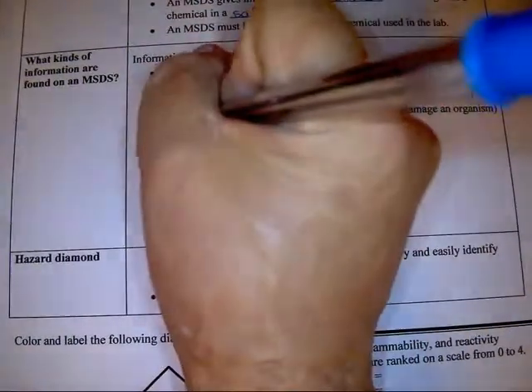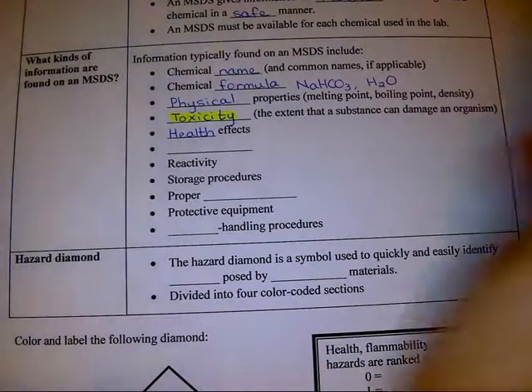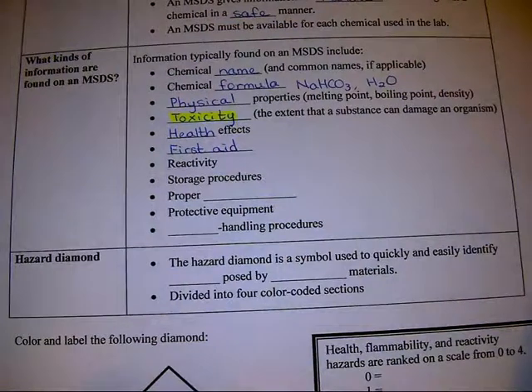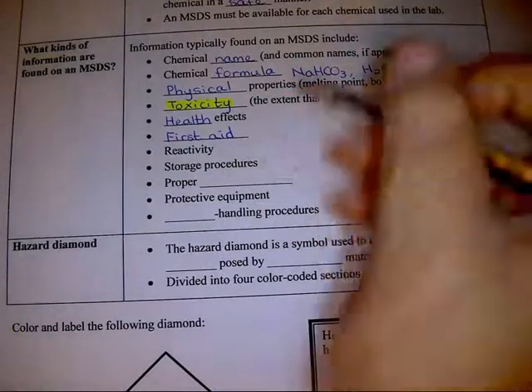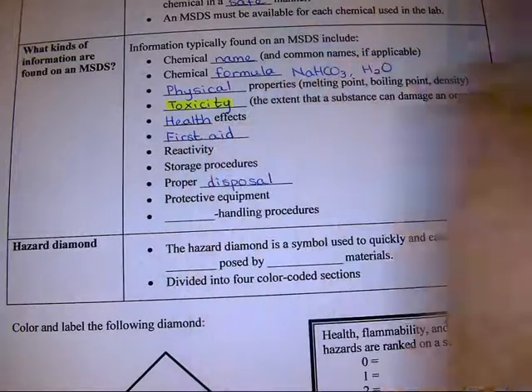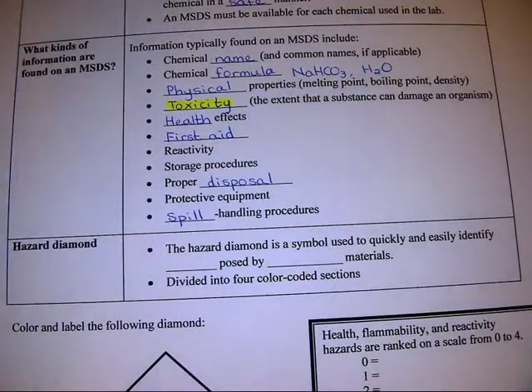On the MSDS, we will also have the health effects. What happens if we breathe it in? What happens if it's exposed to our skin, etc.? And the first aid procedures: what to do if we accidentally ingest it, or if we splash it into our eyes, etc. We will get the reactivity and how to store it, where to store it, and the proper disposal procedure, what to do after we are done with this chemical, what protective equipment to wear, and also some spill handling procedures.